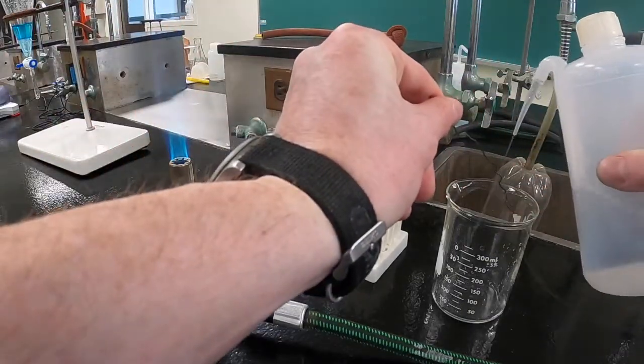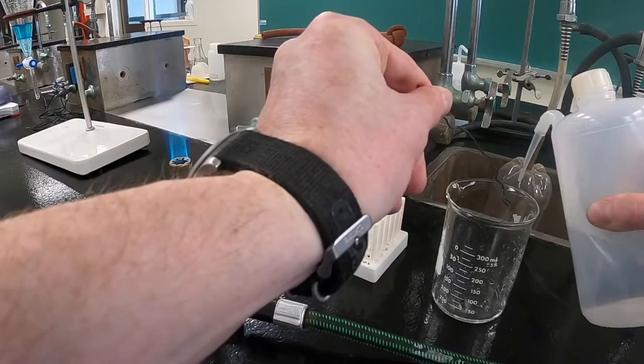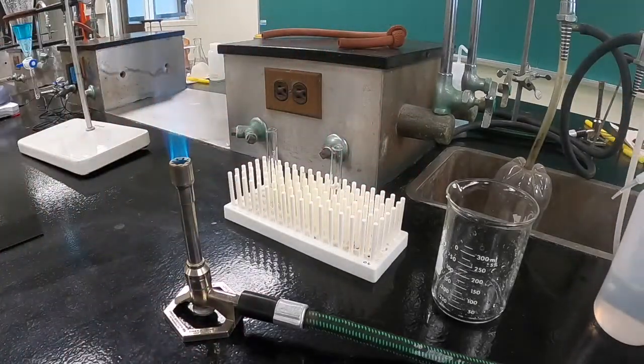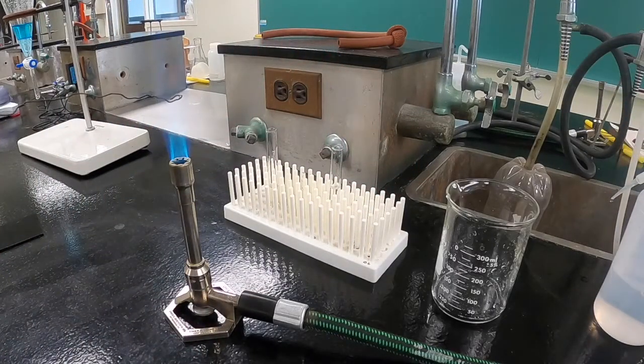Once you've finished testing your sample, you should rinse your wire with distilled water and then hold the wire into the flame to make sure that the color stabilizes again before going on to test your next sample.